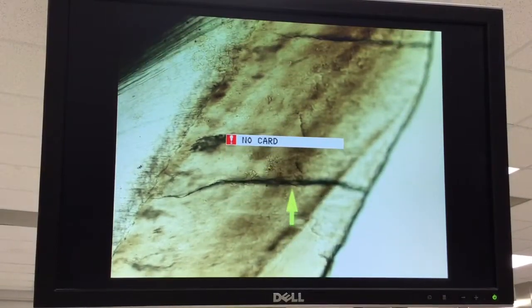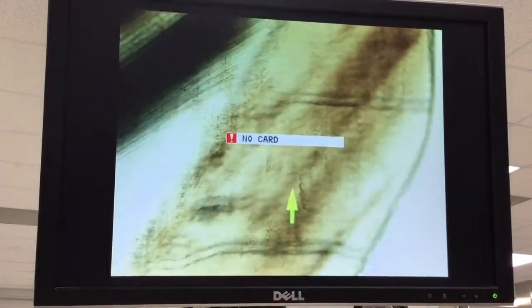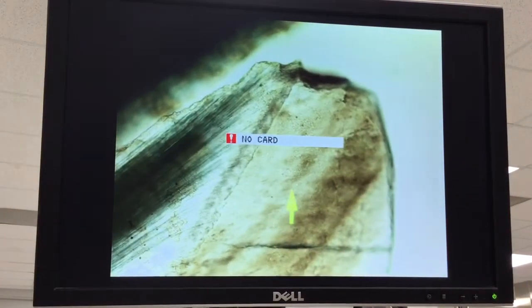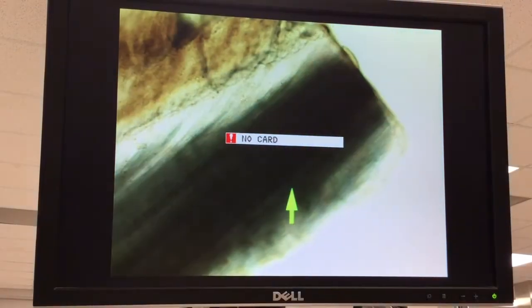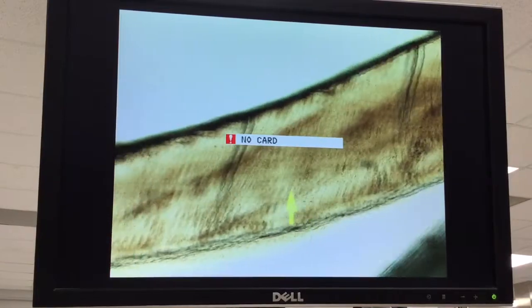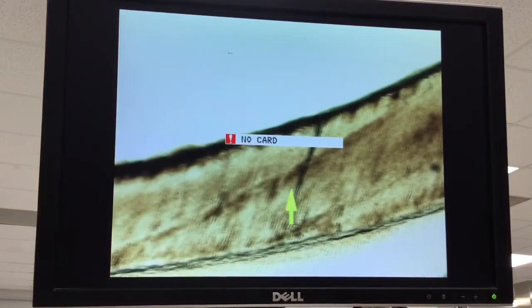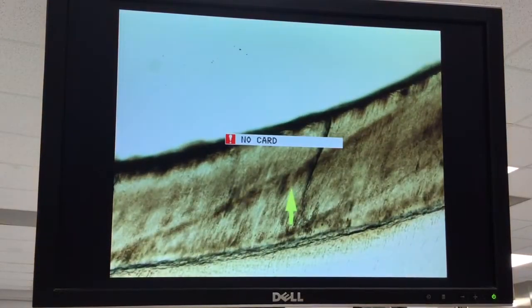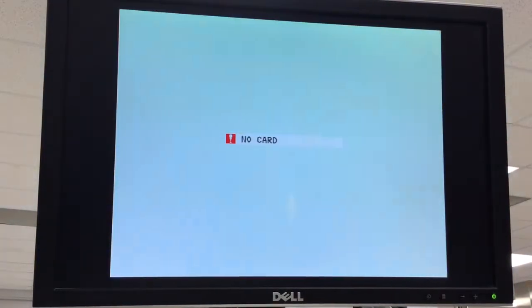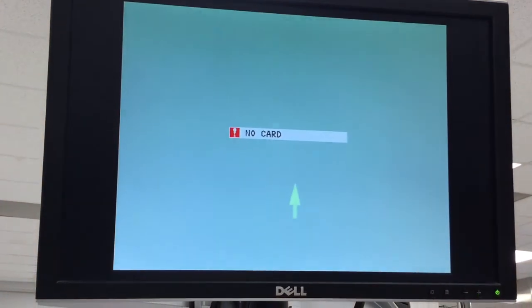More enamel lamella. And then it looks like the tooth fractured during the sectioning. Pretty much the same thing on the other side here. Okay, that's one slide. Let's take a look at some other ones.